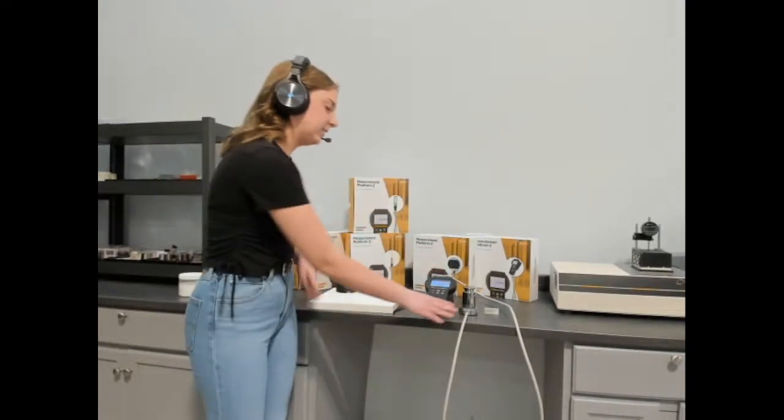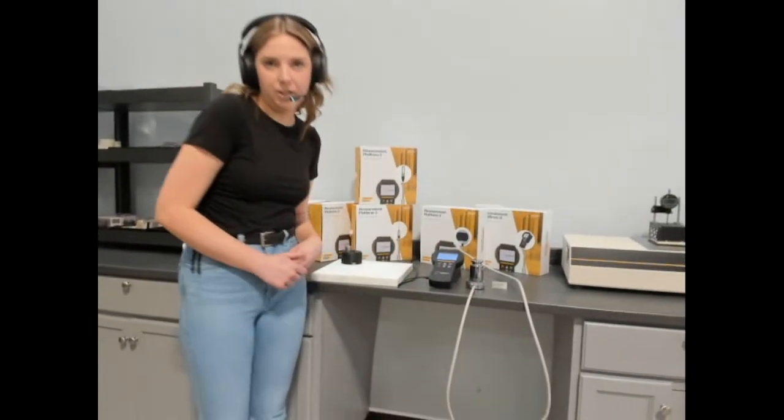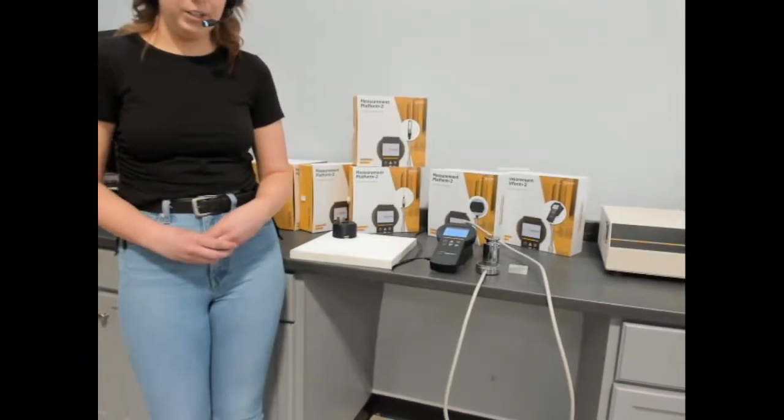The TPS4 sensor is a single-sided transient plane source sensor for measuring solids, paste, and powders.